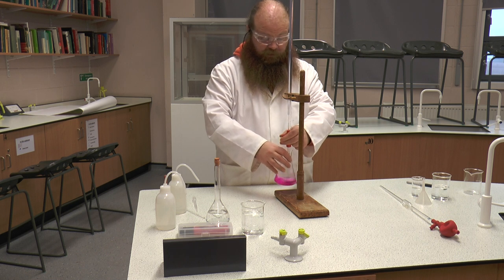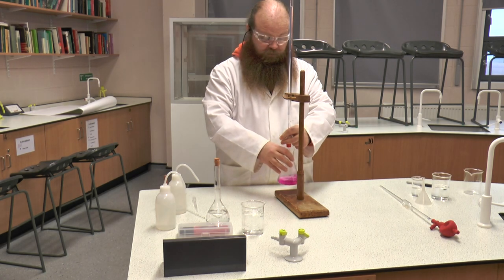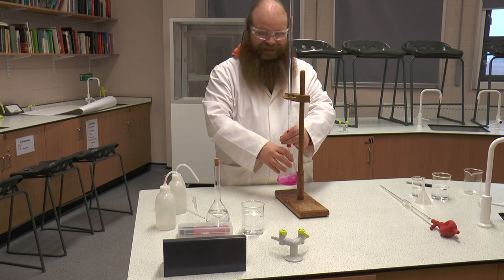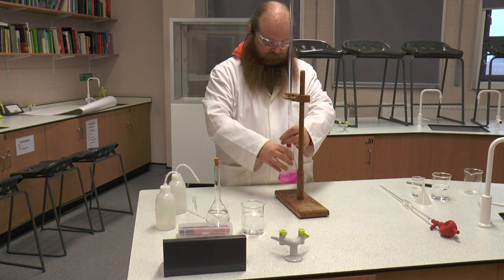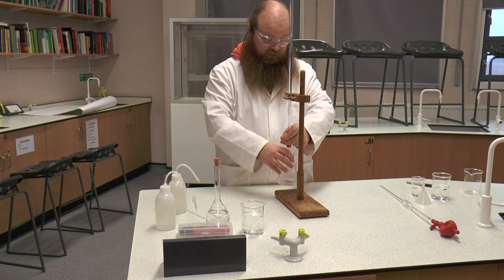You will notice that the indicator will start to weaken and may almost disappear completely and reappear. This is as the reaction occurs between the sodium hydroxide and the hydrochloric acid. The end point for this is when it is clear and it stays clear.